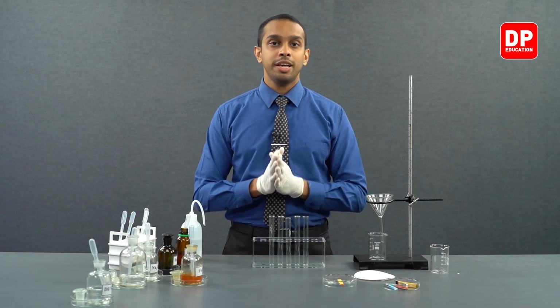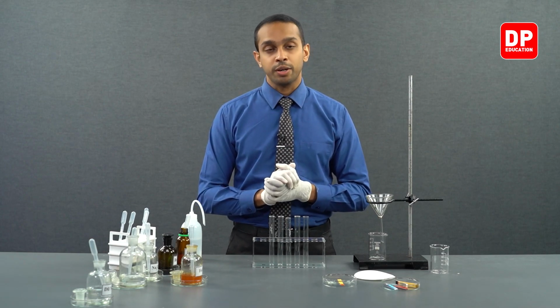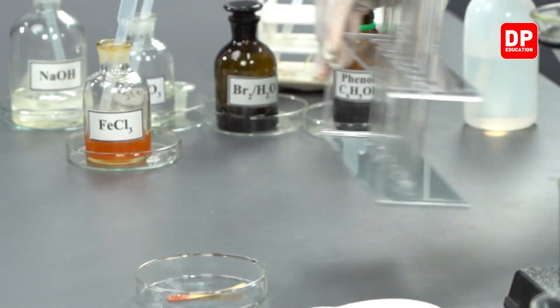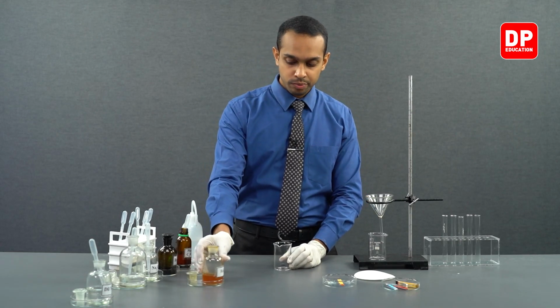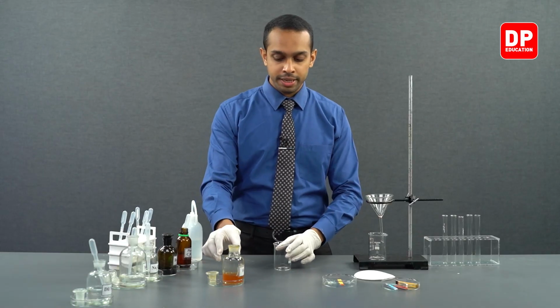Now, let us move on to preparing a neutral ferric chloride solution. For that, we will be using a beaker. Let's use our ferric chloride solution. We'll transfer the ferric chloride solution into a beaker.